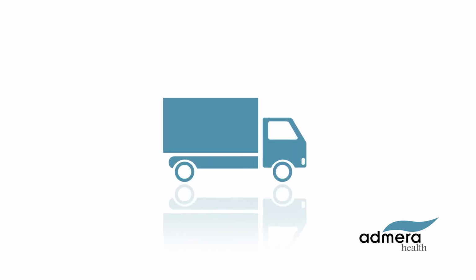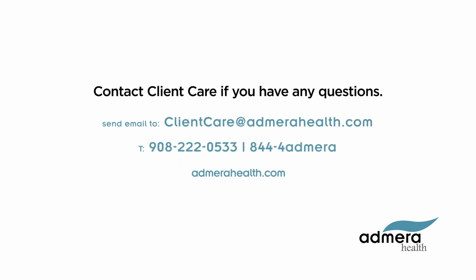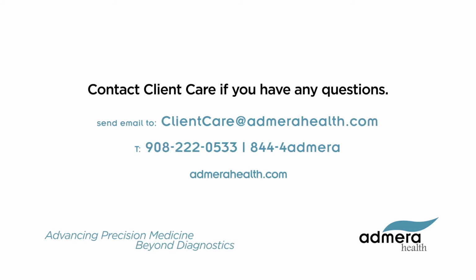Bring the package to FedEx facility or arrange pickup to ship to Admera Health. Contact Client Care if you have any questions. Admera Health, advancing precision medicine beyond diagnostics.